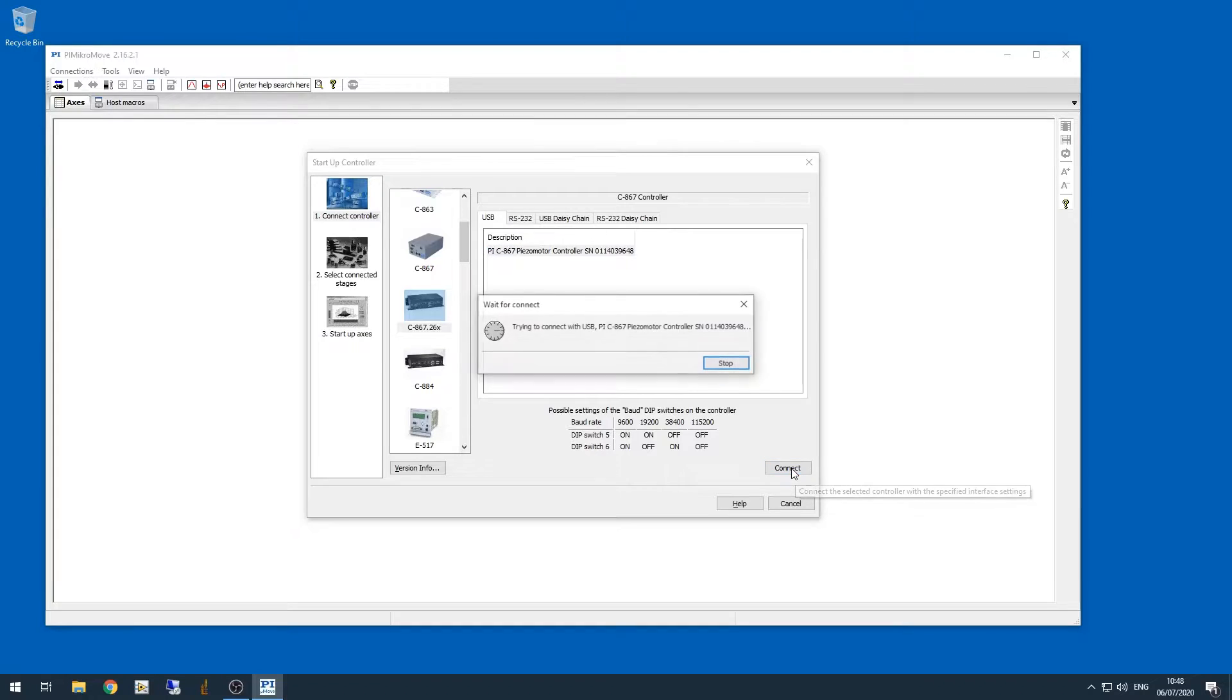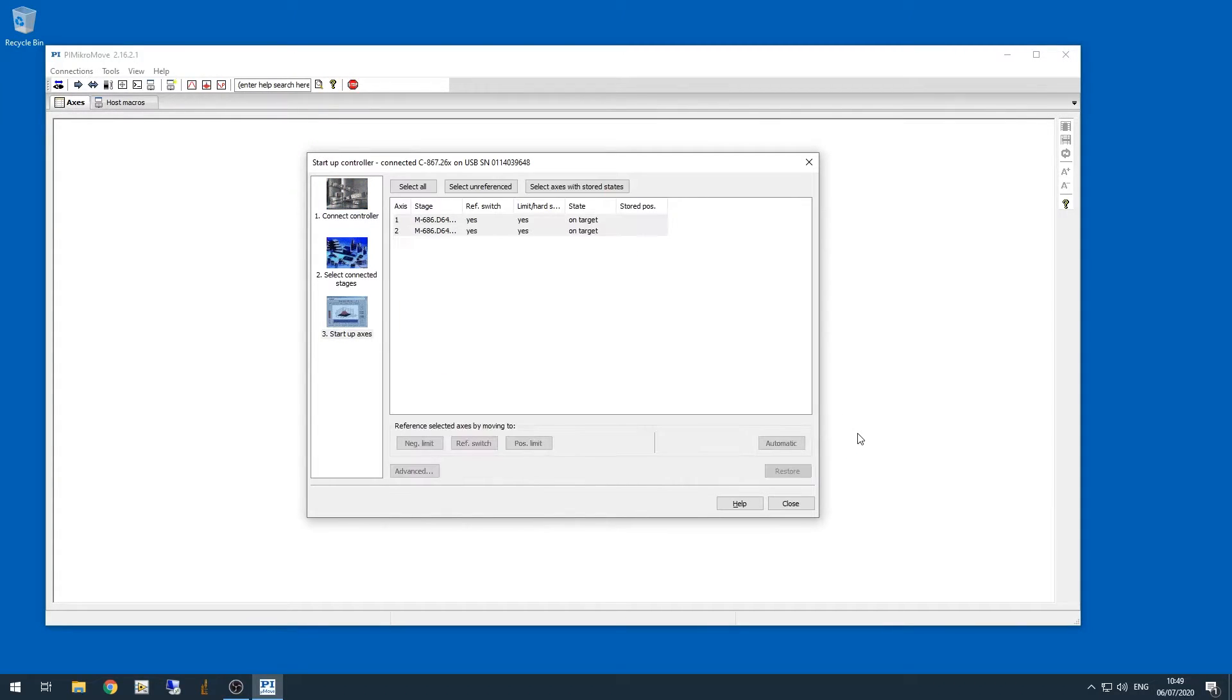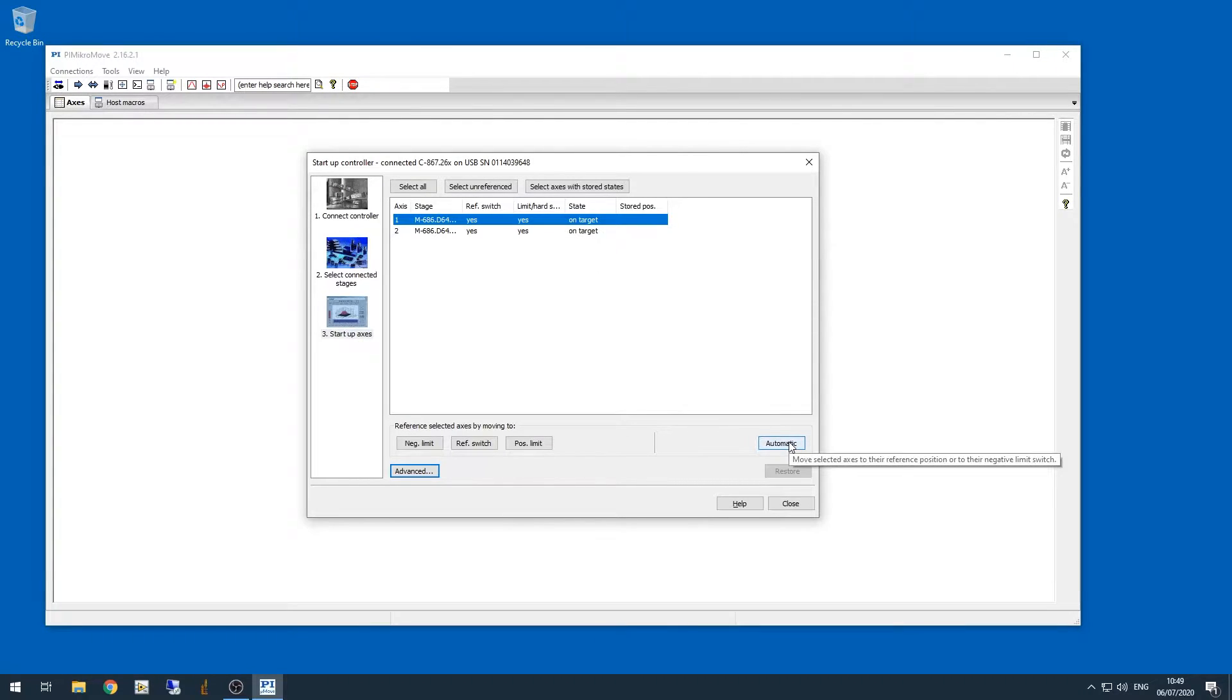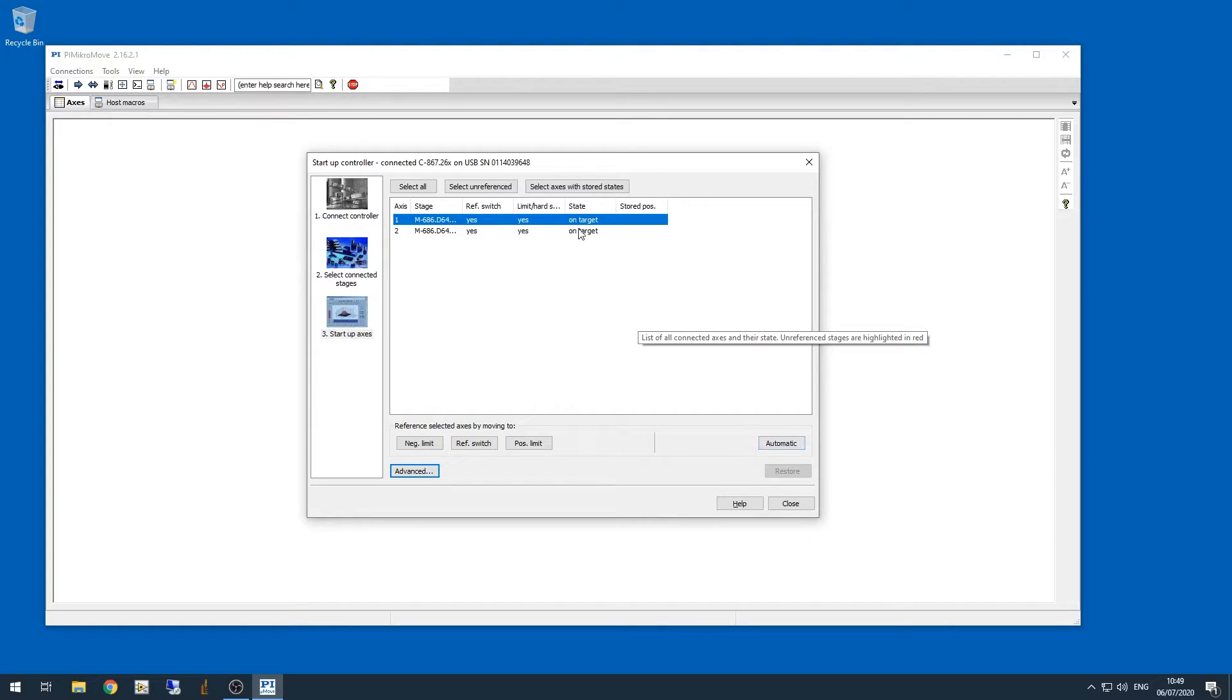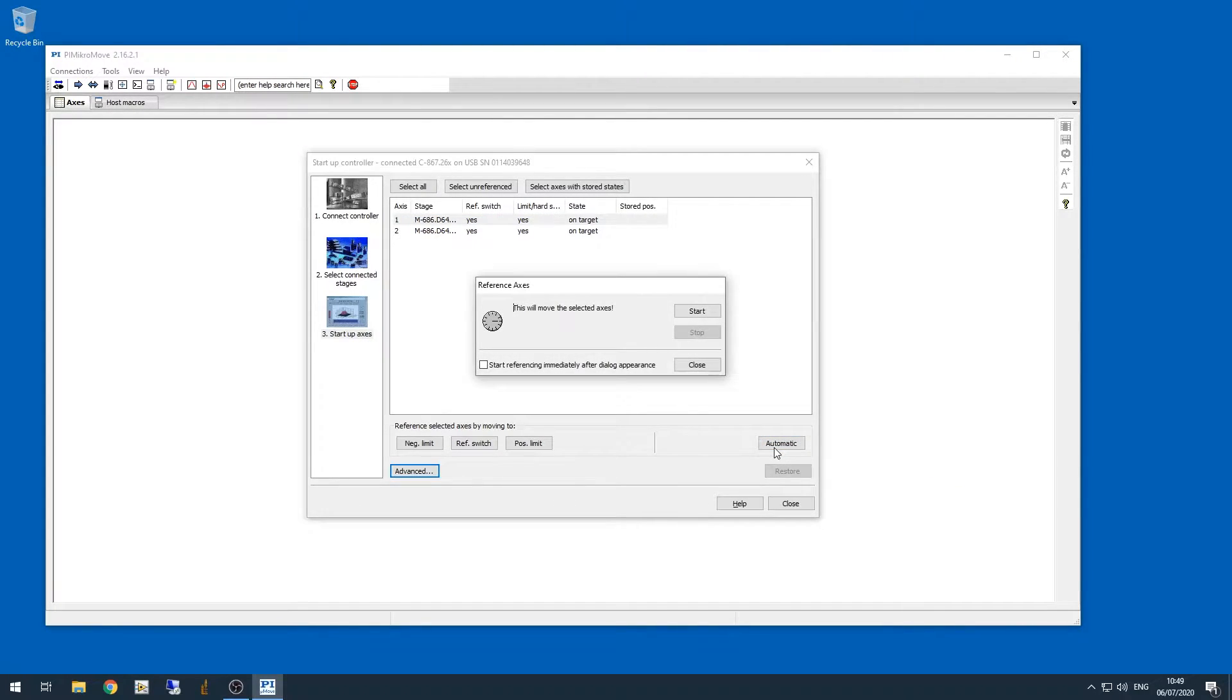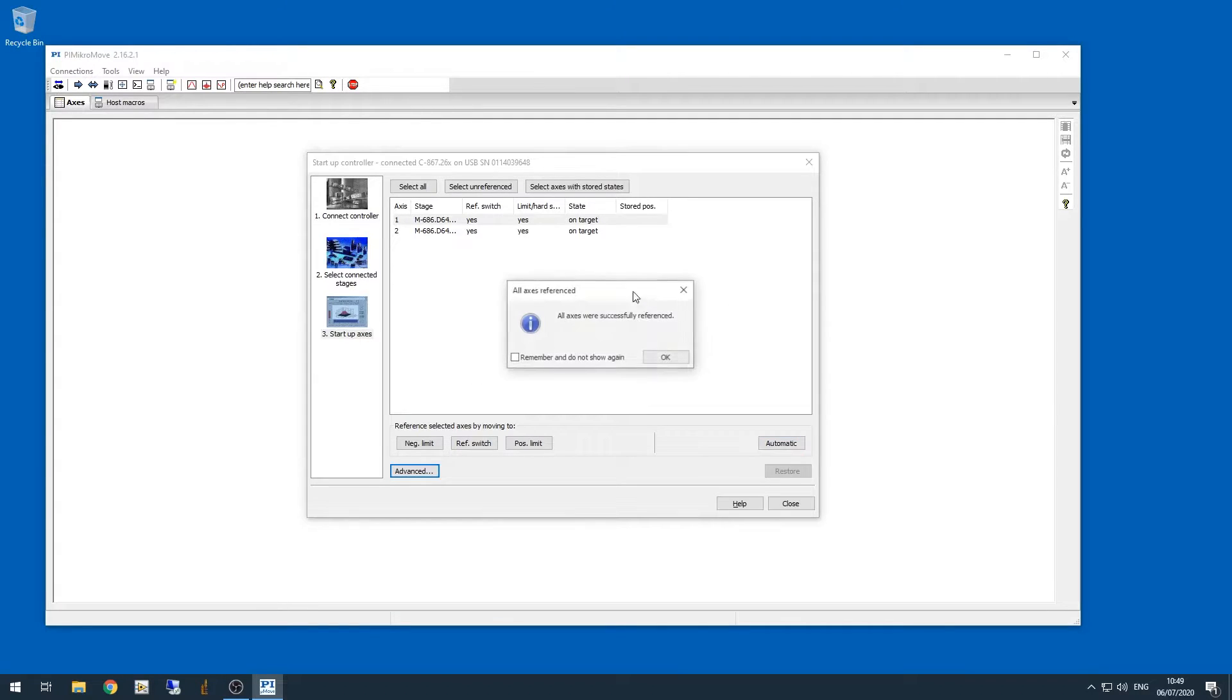Now I'm clicking connect, and we have to wait for a minute while the connection is opened. Now that we're connected, we can see there are two axes for this stage. Let's click on the first axis, and then click the button that says automatic. This will tell the software that we want to automatically reference this axis. Click start, and once it's done referencing the axis, click OK.